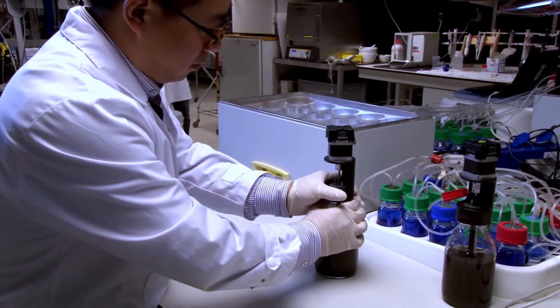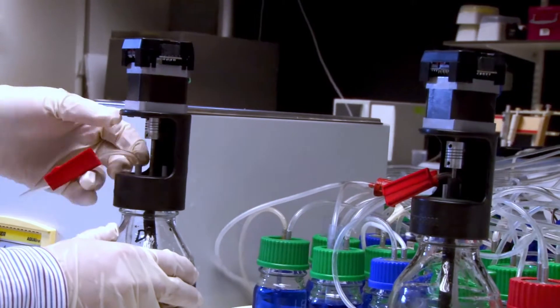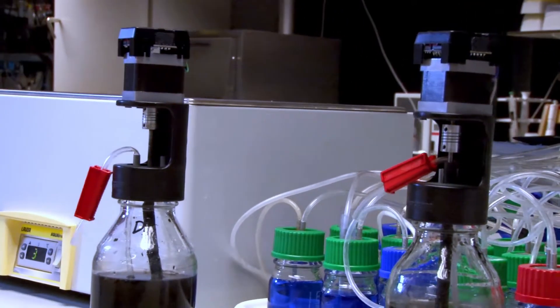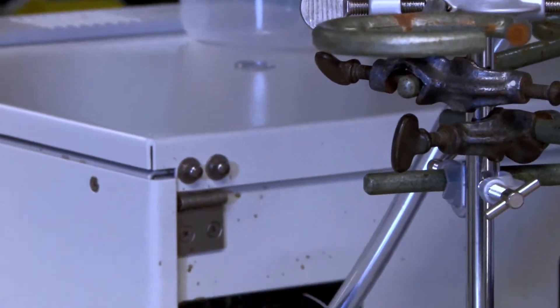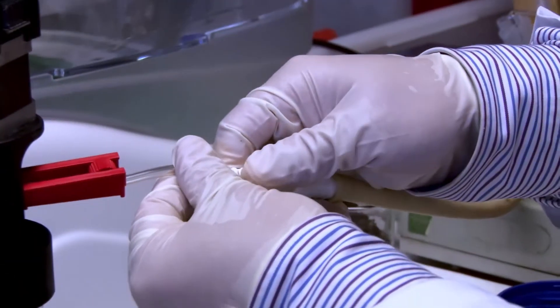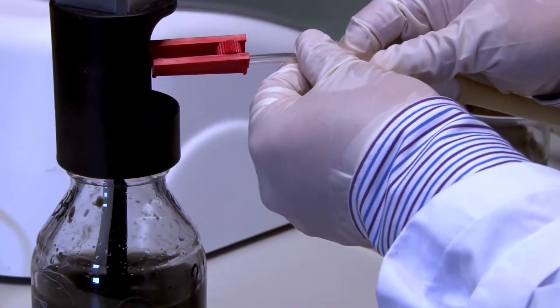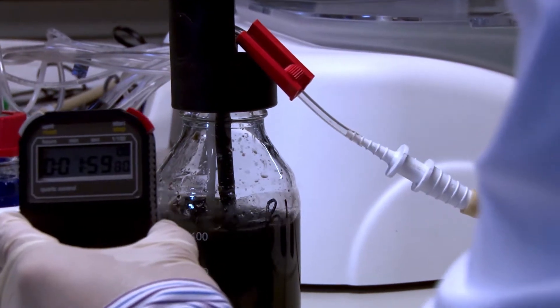To achieve anaerobic conditions, using the extra inlet at the lid of the bottle, flush for two minutes all of the bottles with the gas, composed of a mixture of nitrogen gas and carbon dioxide. Close the red valve.